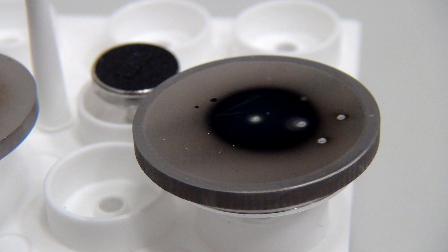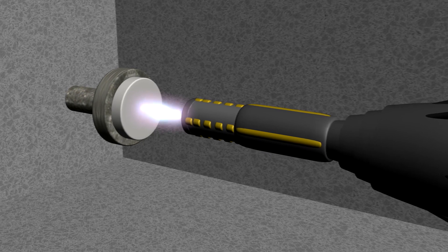The performance of our sample has already been tested by exposing it to high-energy plasma, similarly to real conditions.